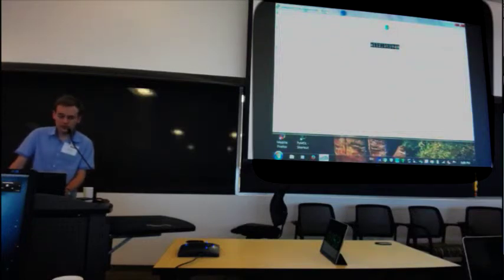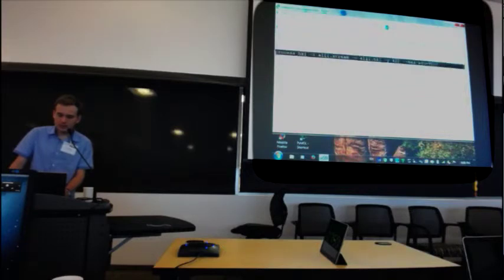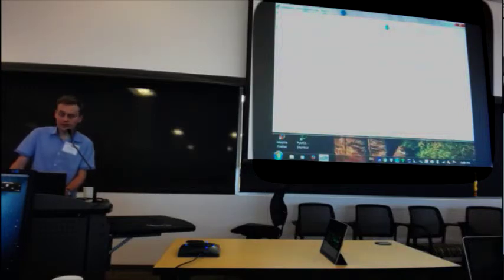Then it will perform the Monte Carlo integration, which is the process_hkl command, on both halves. Output HKL files. This is the point group and then the max ADU that I was using. Everything above 9,500 counts will be discarded. And then it will calculate some of the statistics using these commands, and finally merge the whole data set into one HKL file.